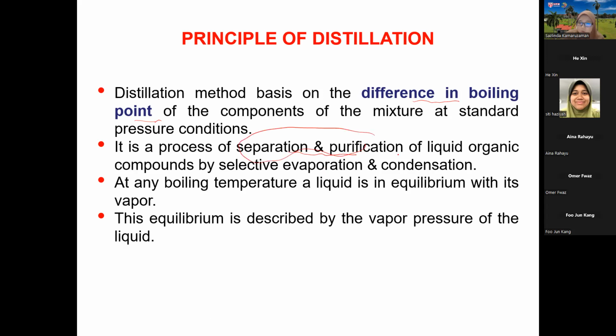And the most important thing is the cycle that happens in the system, which we call evaporation or vaporization and also condensation. So this is the most important one that I believe you should know, at least the basic principle, when we talk about distillation.